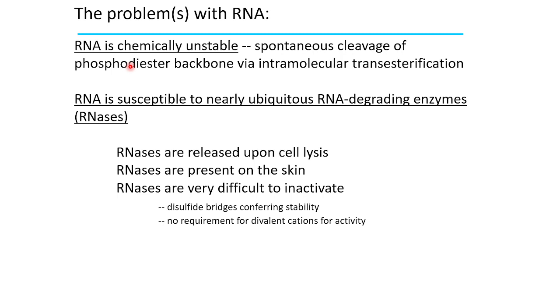So we got to know about the problem with RNA. We were aware of it, but just briefly mentioned it. So now you think of the PCR. Now we will talk about PCR. So what is it?